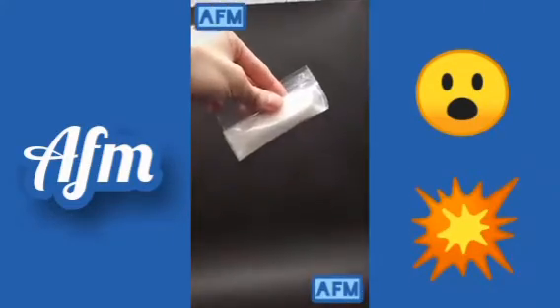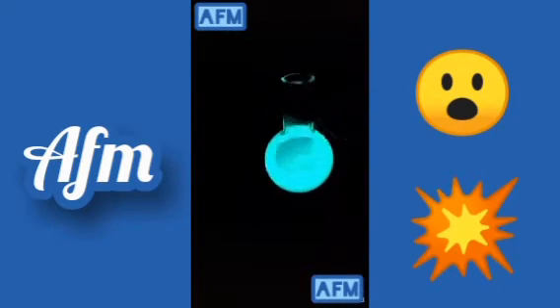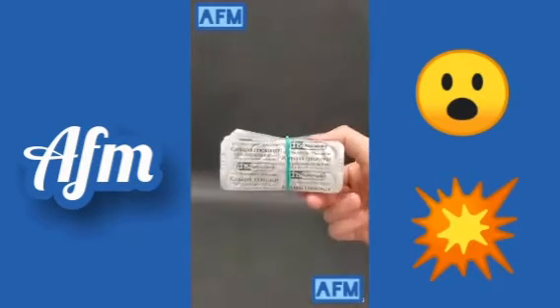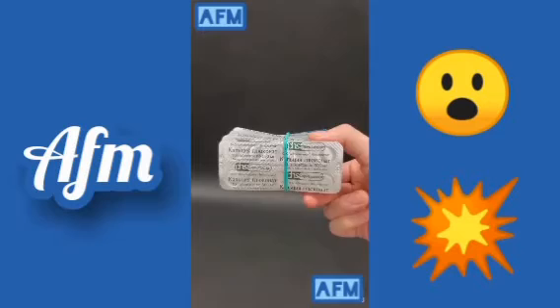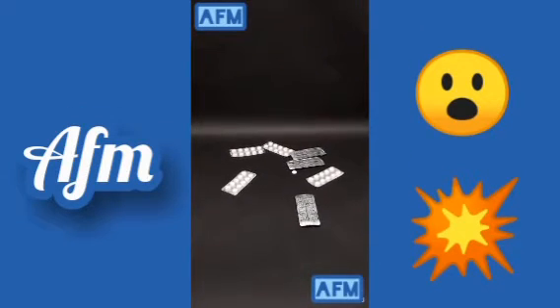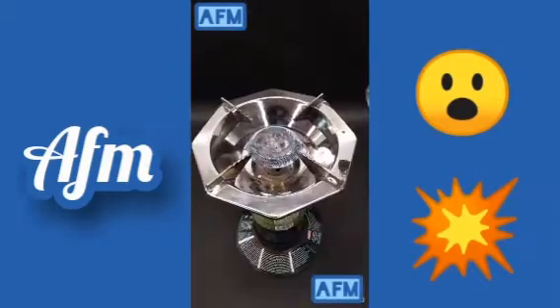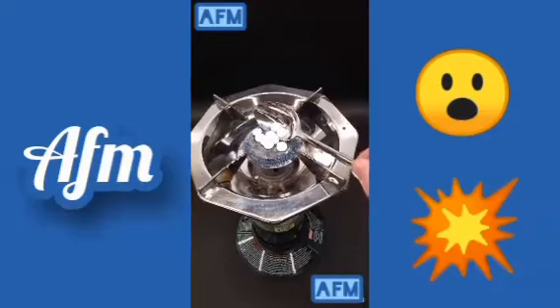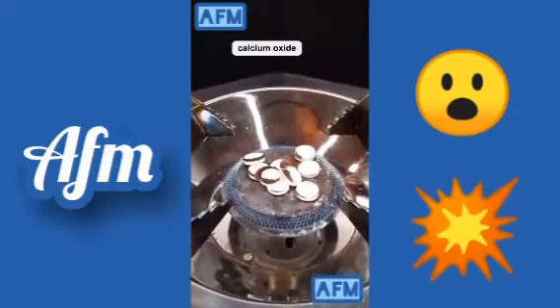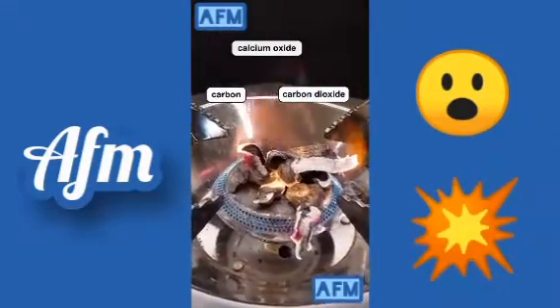A little while ago, I showed you guys some powder that I got from Russia, and I used it to make a giant glowing thing. What I didn't tell you was that around the same time, I also got a bunch of pills from Russia. But this, unfortunately, isn't sketchy either, and they're all just made of something called calcium gluconate. It's meant to be taken as a calcium supplement, but what's cool about it is what happens when it's burned. It breaks down into calcium oxide, carbon dioxide, and carbon, and it grows as a weird snake thing.